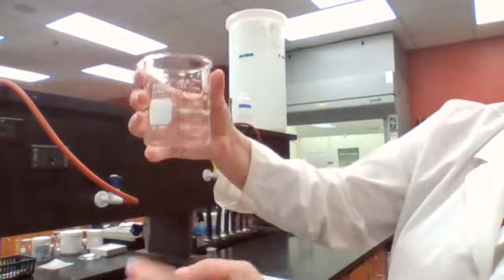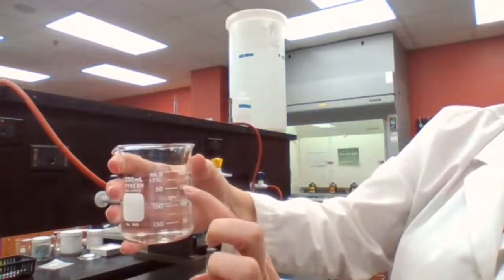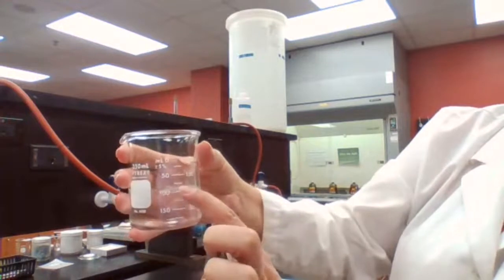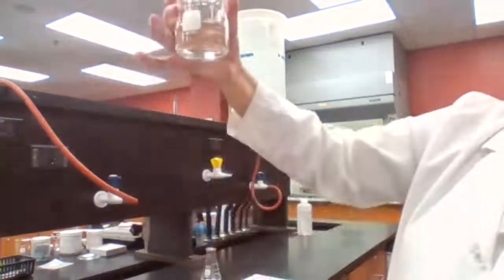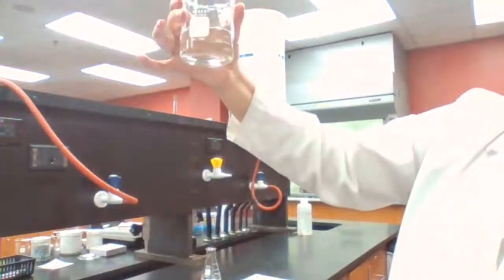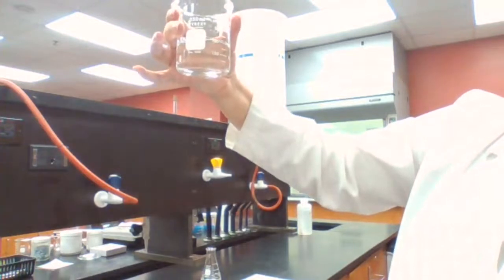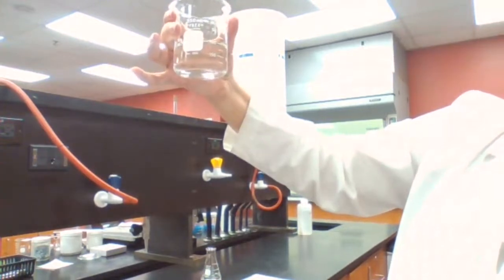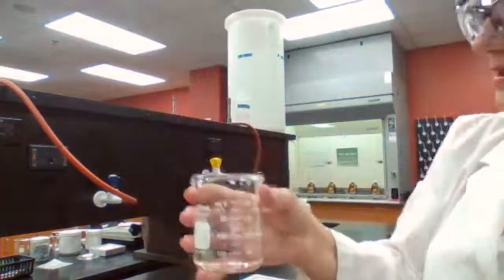And then you have to interpolate the number, basically. So it's between 100 and 125. There is a line in between the two. So it would be 100, and this is 125. To me, it's not exactly in between. If it was exactly in between, it would be like 112.5. So to me, it's like 110 milliliter at this point. So about 110.